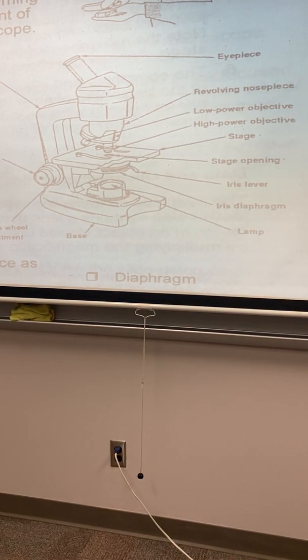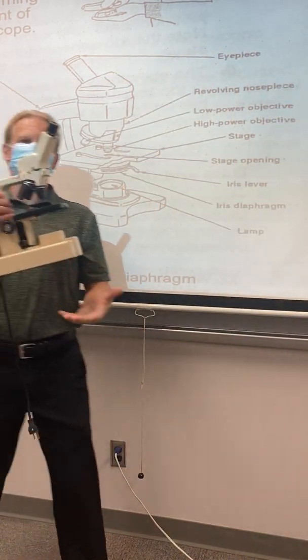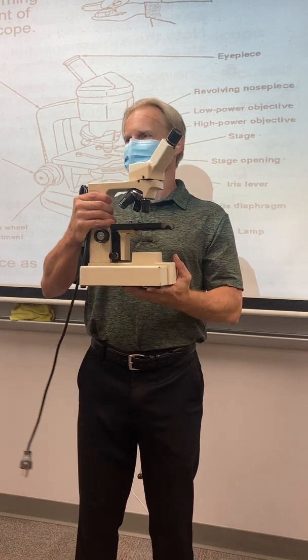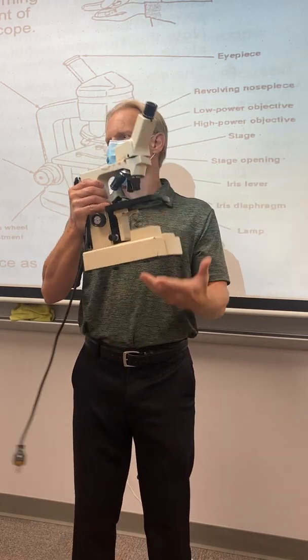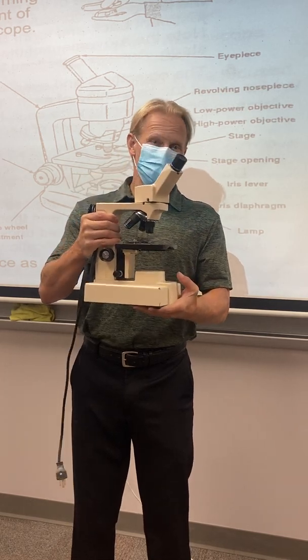I've got them listed up here on the board for you. First off, when you carry your microscope, you hold it by the base and you hold it by the arm here. Make sure it's not plugged in, so you don't walk off and it yanks the cord out of your hand. So hold it like this just to be careful with the thing.